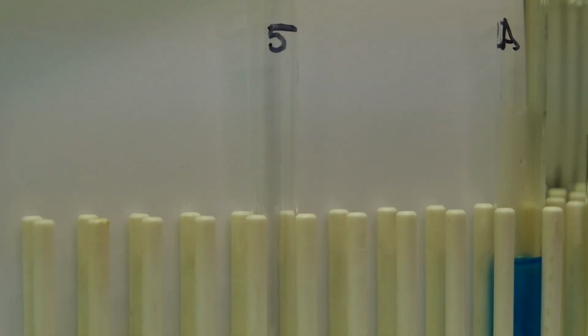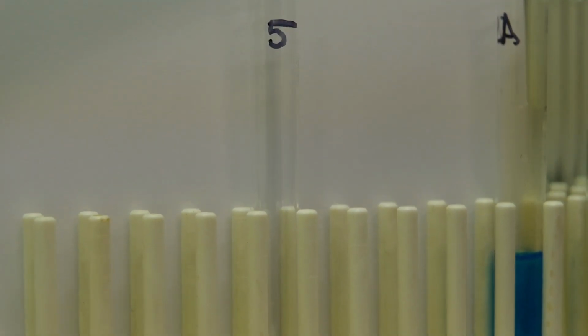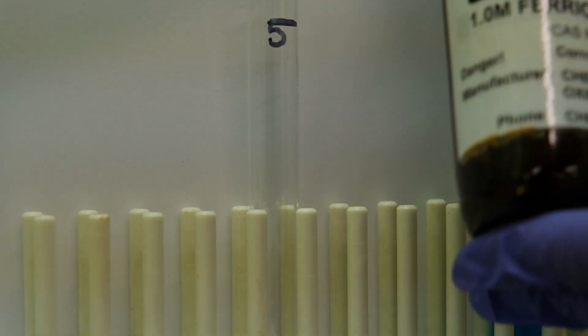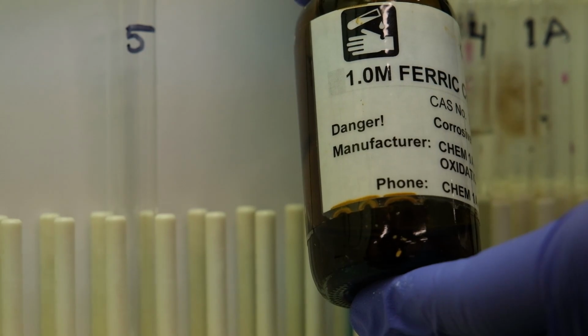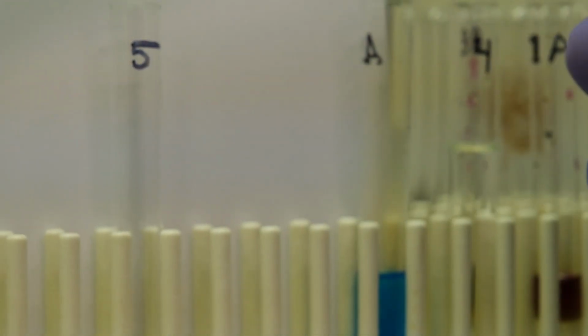This is for experiment 5, system 4. First, we're going to add approximately 2 milliliters of the 1.0 molar ferric chloride.